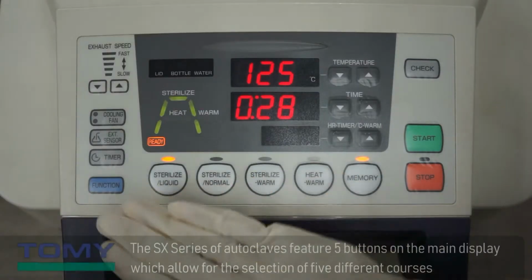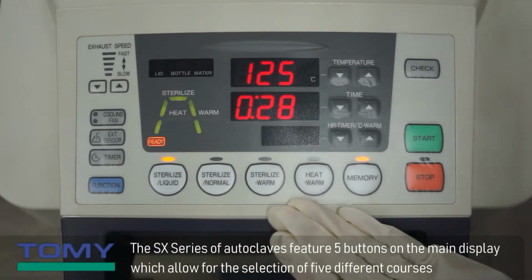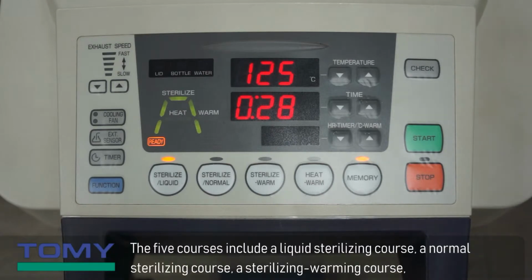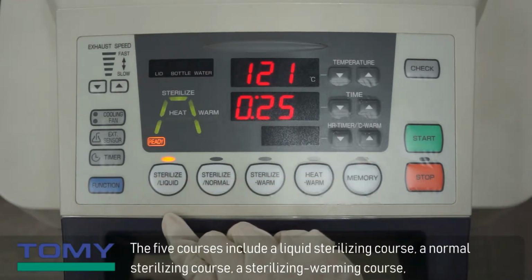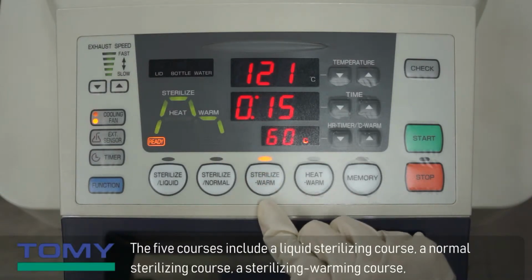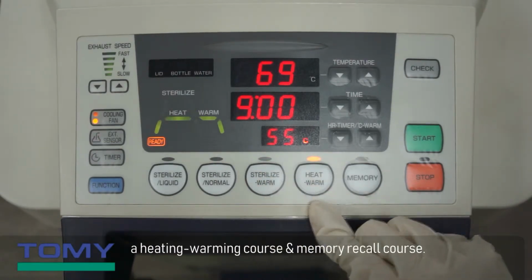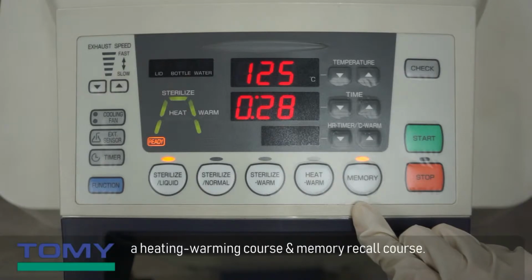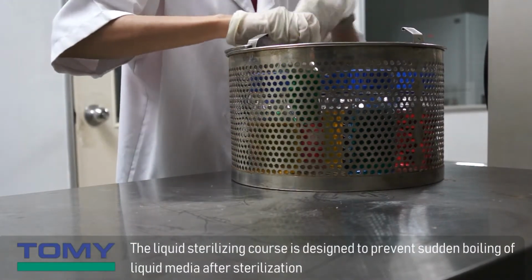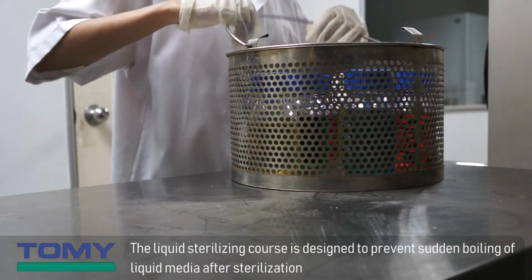The SX series of autoclaves feature 5 buttons on the main display which allow for the selection of 5 different courses. The 5 courses include a liquid sterilizing course, a normal sterilizing course, a sterilizing warming course, a heating warming course and memory recall course. The liquid sterilizing course is designed to prevent sudden boiling of liquid media after sterilization.